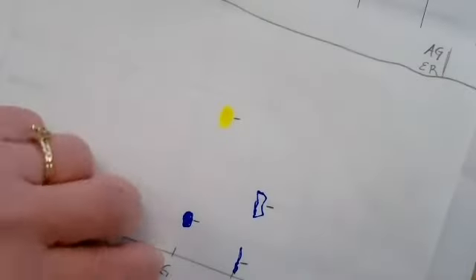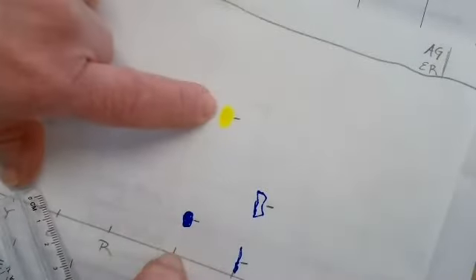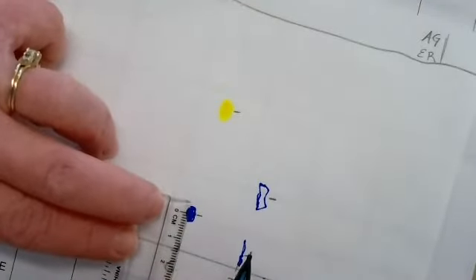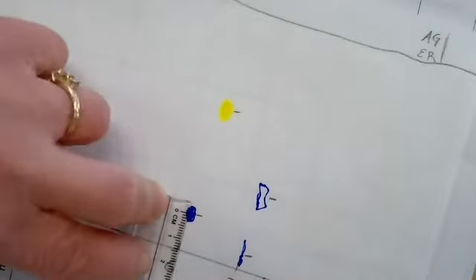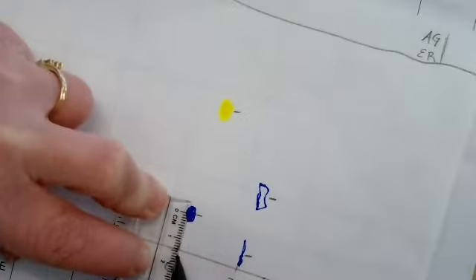And then the distance the spot traveled. So what you are doing is going from start to the middle for each of your blobs. Sorry, I'm just calling it blob. Each of your separate results. Remember, sig figs with our measuring tools. We can go to the 100th place, so 0.94 centimeters.